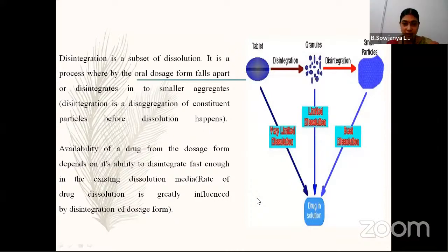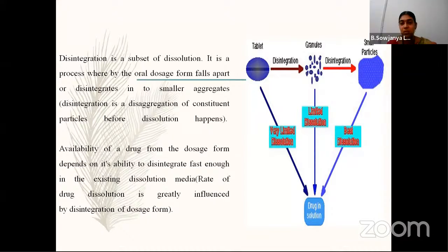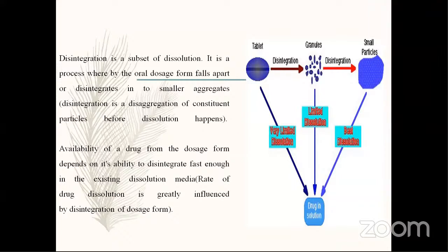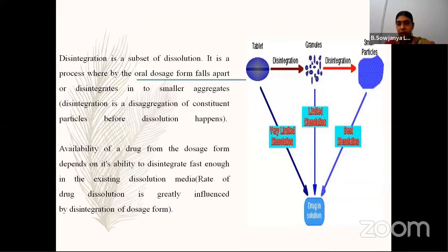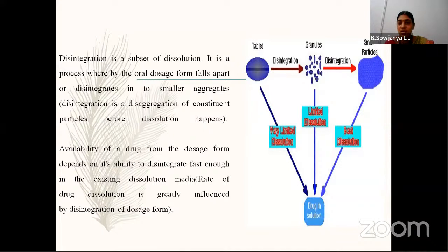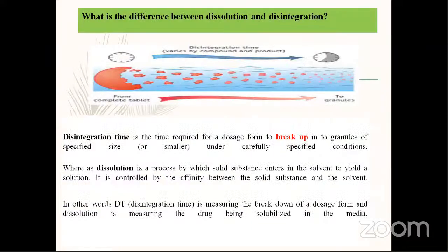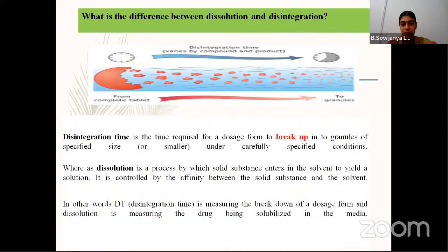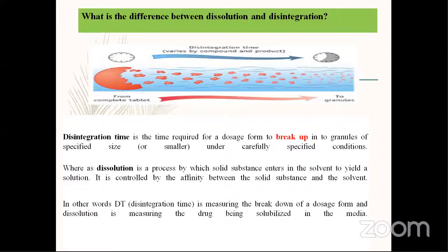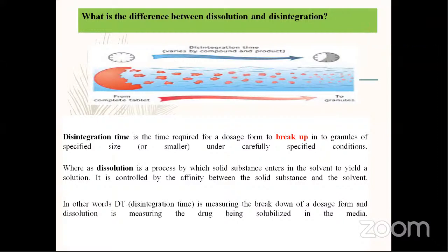So dissolution rate. Some persons asked about the dissolution rate. So dissolution rate is nothing but whatever the particles... Okay, whatever tablet or capsule we have taken, when it enters the solution, complete disintegration happens, and how fast dissolution happens is the dissolution rate. So the dissolution process is the process of mass transfer of solid substances into a given solvent within a specific time period, called the dissolution rate.